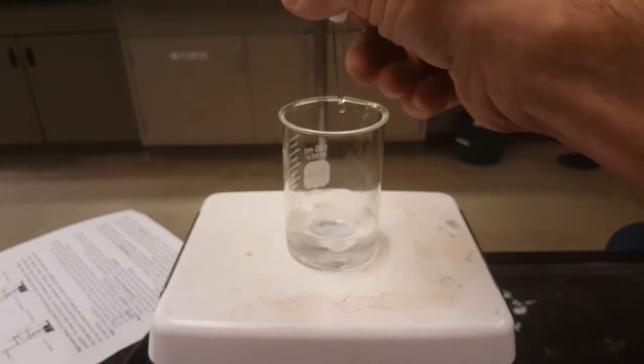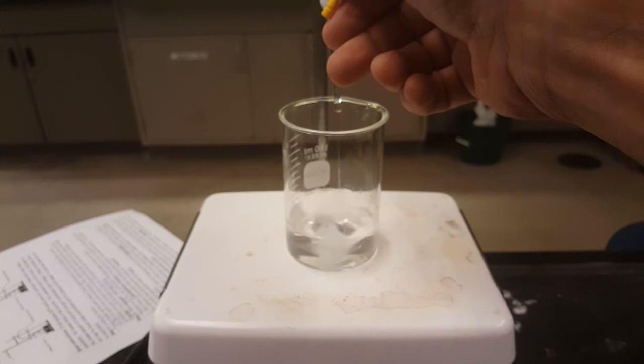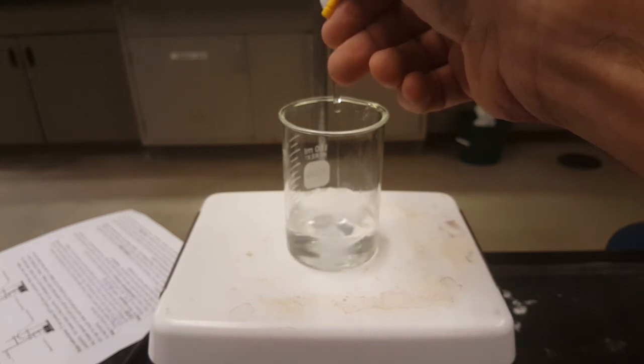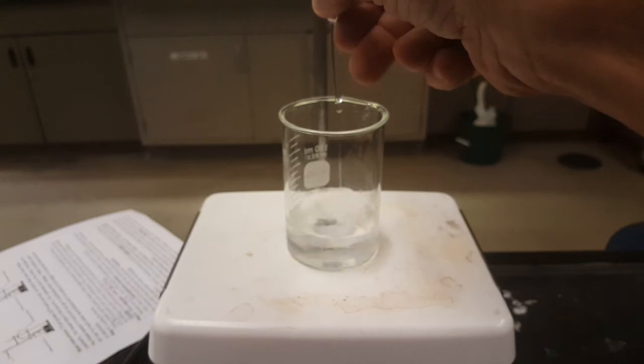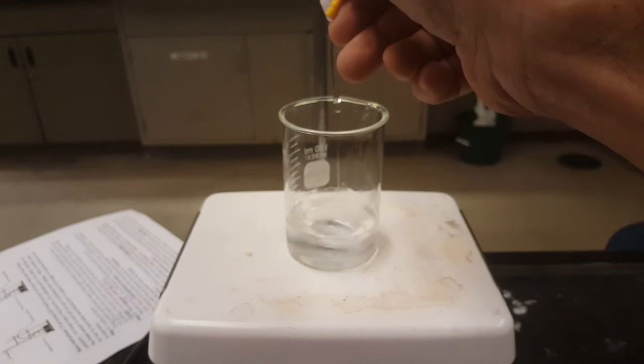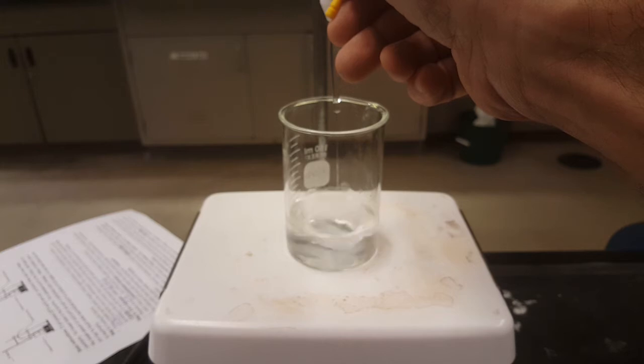Initially, when I add the base to the acid, we see no color change. So you can add it rather quickly until you start seeing a significant color change to pink.